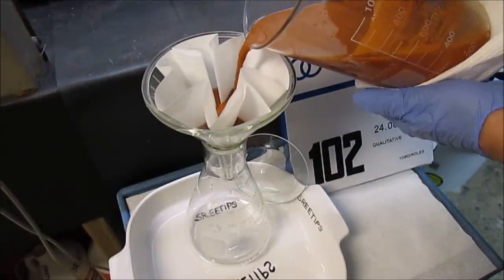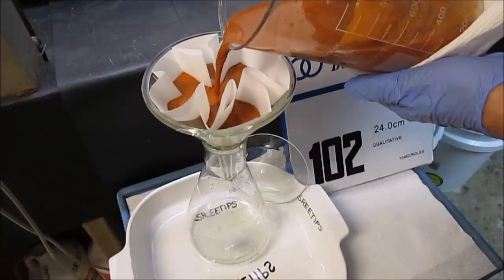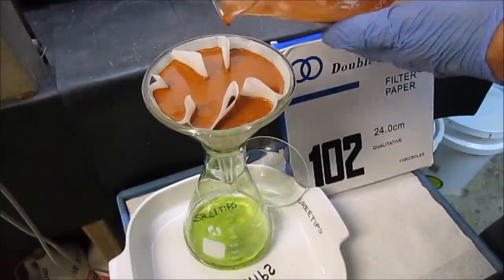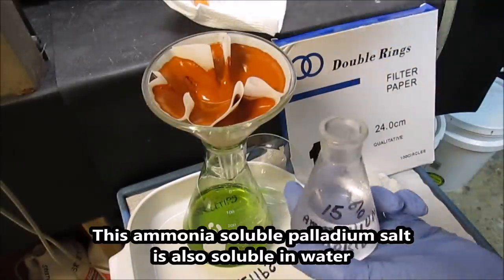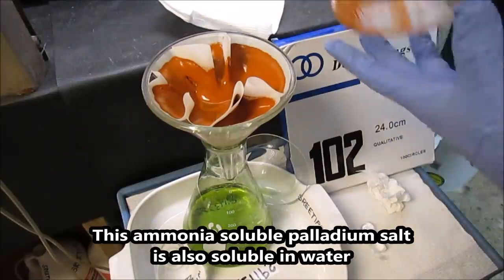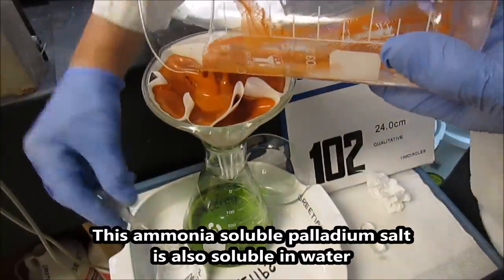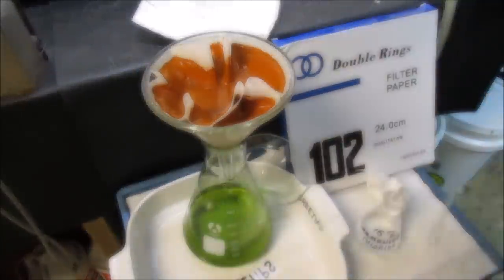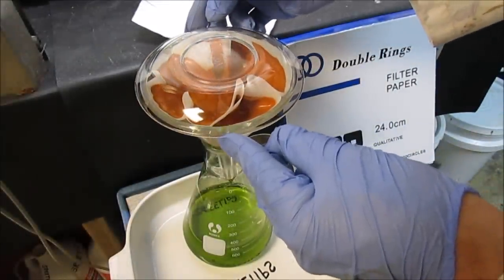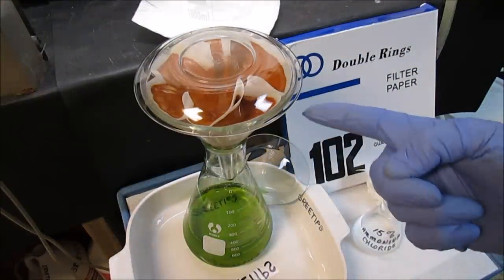I'm using a 15% ammonium chloride solution to rinse out the remaining palladium salt out of the beaker. I'm going to go ahead and cover this up to protect it from anything getting in there, and let all that solution drain out. Then we'll go to the next step, which is to dissolve this salt in ammonia.